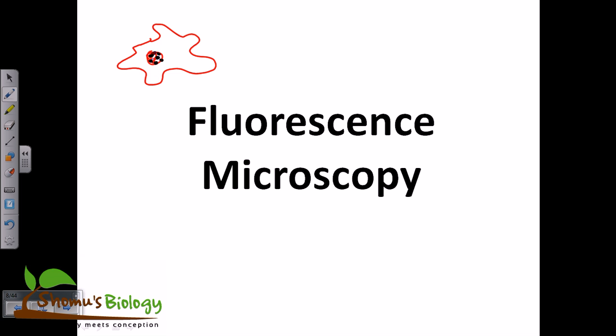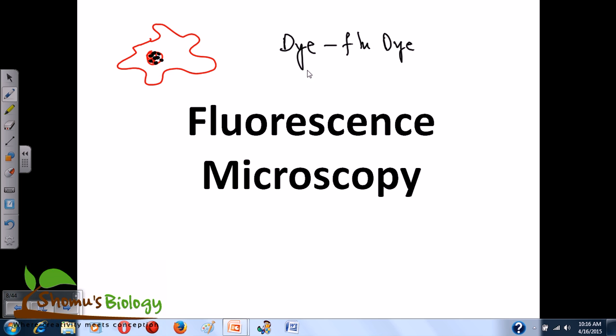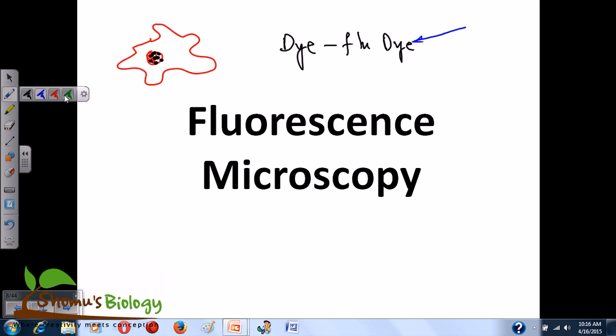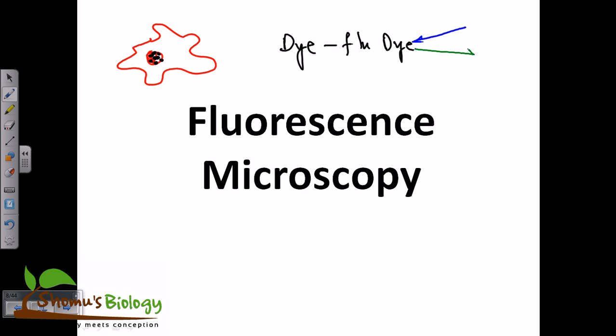Now this chemical factor, the dye that we are providing, has a property called fluorescence. This dye, also called a fluorescent dye, can receive light of a particular wavelength, for example blue light, and in turn emit light of a different color, in this case green light, right? So blue light hits the dye, the dye gets excited, and then the dye releases green light, which we can measure.